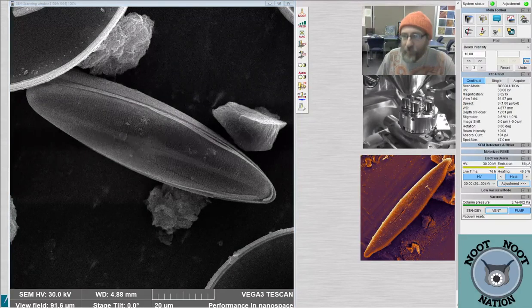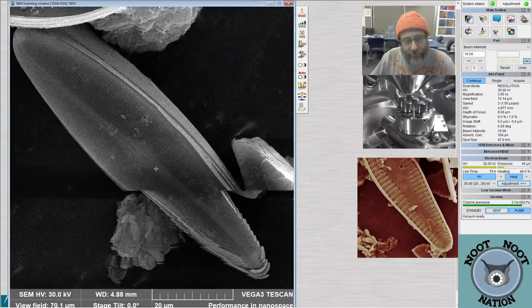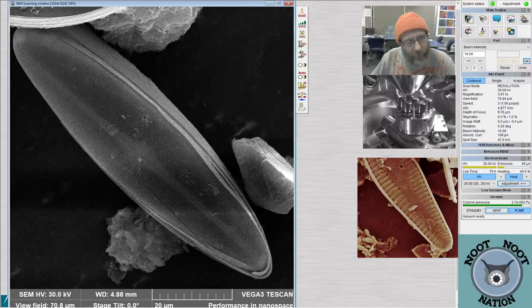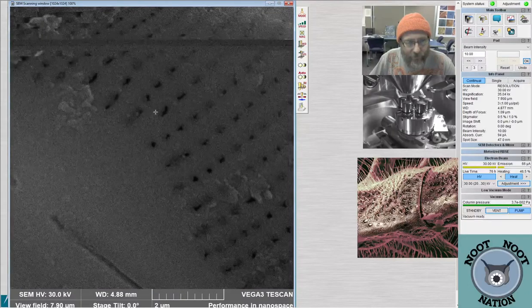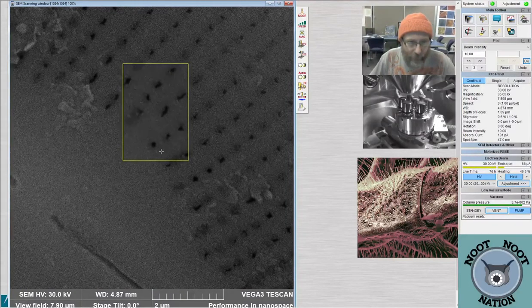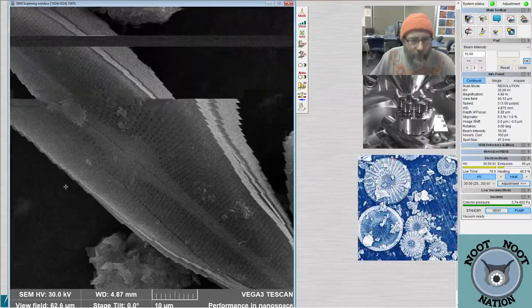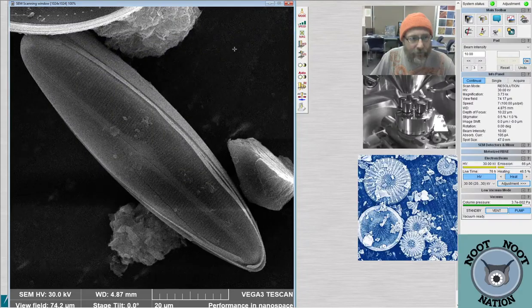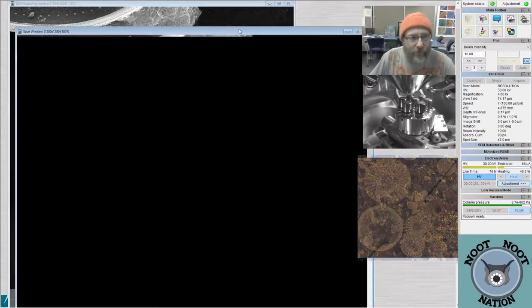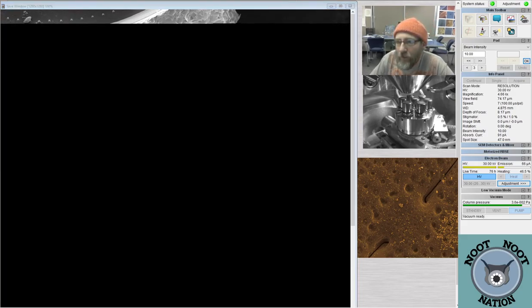First I'm gonna rotate a little bit, so it's a 45 degree angle, and I'm gonna try to get the focus. And we'll collect a real quick image of this one, and I can hang out with chat a little bit, and then we'll look for one more thing to image before we go. Okay, I'm zooming down. Let's see.